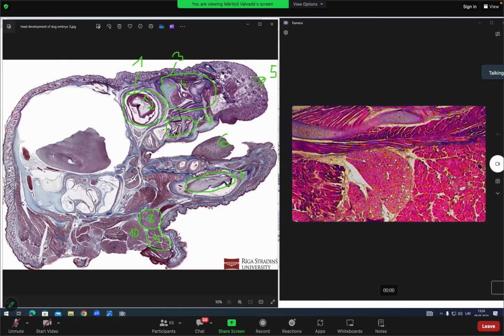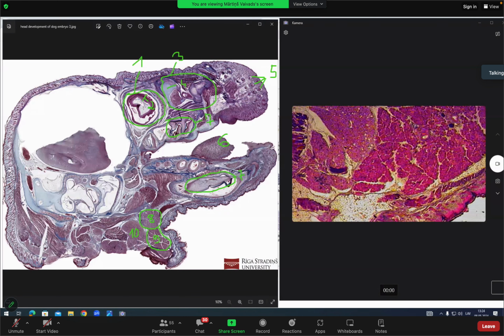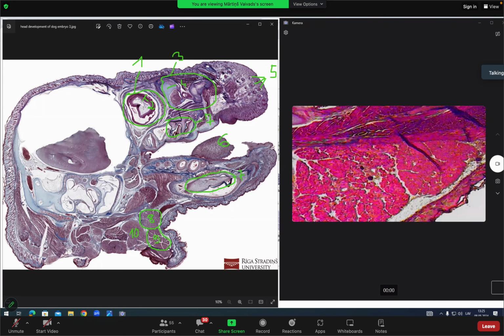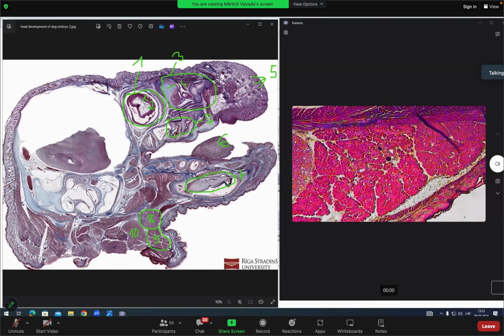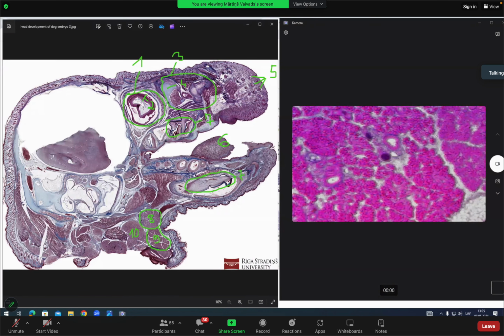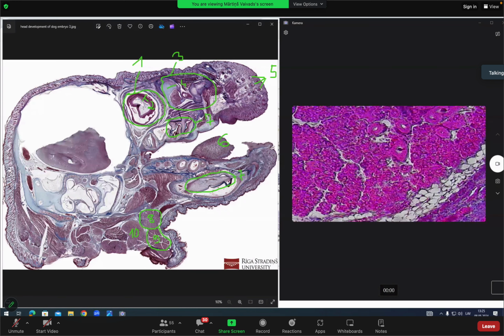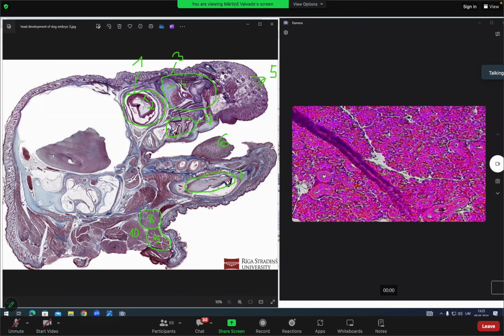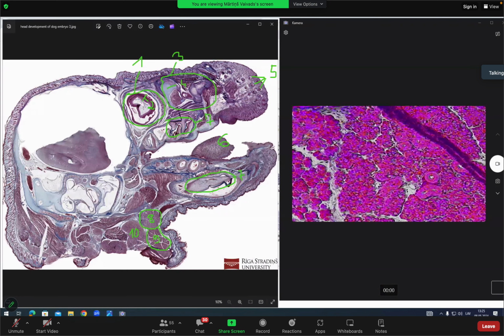So this neck region is very tricky because all of these tissues at low magnification look very similar. So here in the microscope, I will zoom in a bit closer so you can see the differences. So if you zoom in to higher magnification and you check these glands here, there's quite a lot of them. They look quite similar to each other, but some glands look a bit lighter.